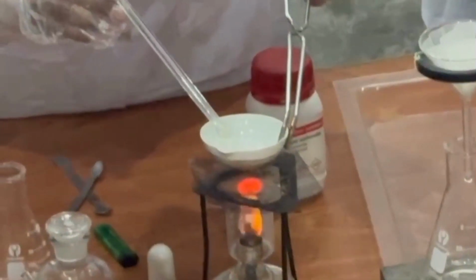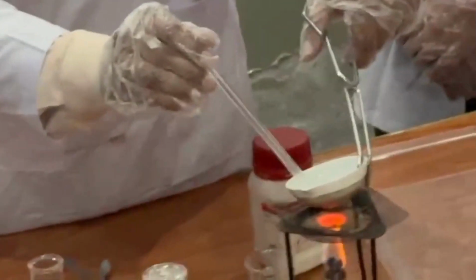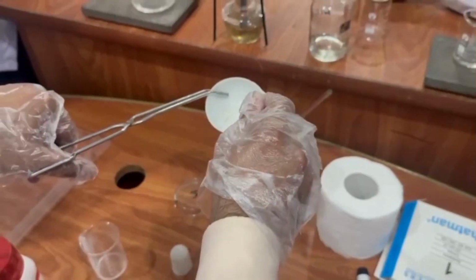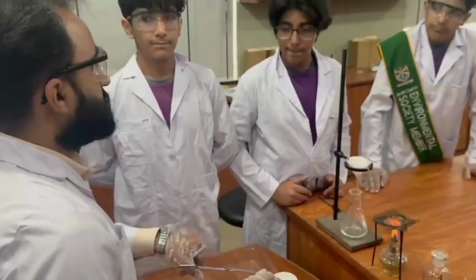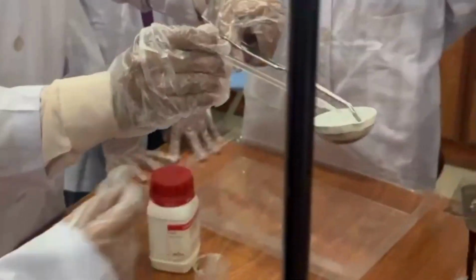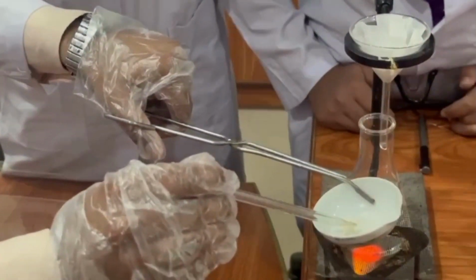Sir, can we taste this salt? Please show it. These are the crystals of salt. This is actually zinc chloride salt. The same procedure can be applied to make the crystals of calcium chloride. Sir, can we eat this salt? We have already heated and evaporated the excess amount of water.